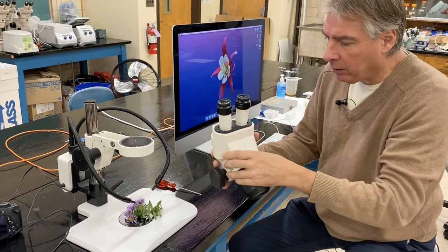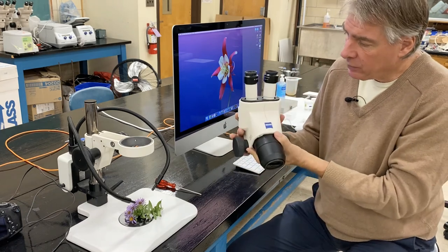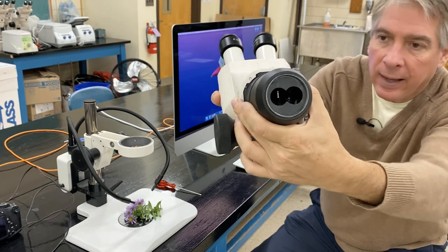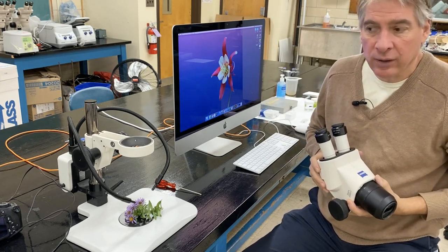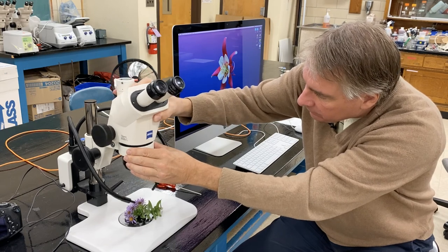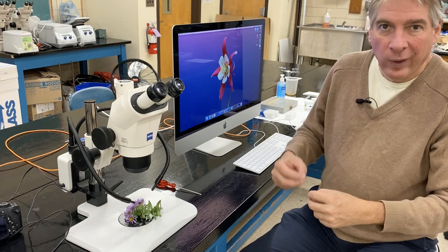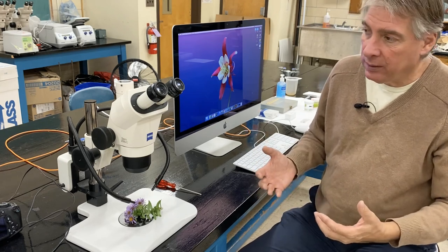The scopes we have here are called Zeiss STEMI 2000s, and they're called a stereo microscope because there are two light paths — one for the left eye and one for the right eye. You can see down at the bottom there are two lenses at the end of the microscope, and that allows you to maintain stereo vision.